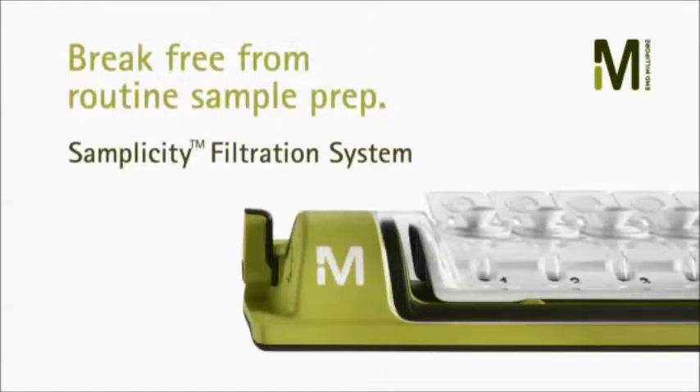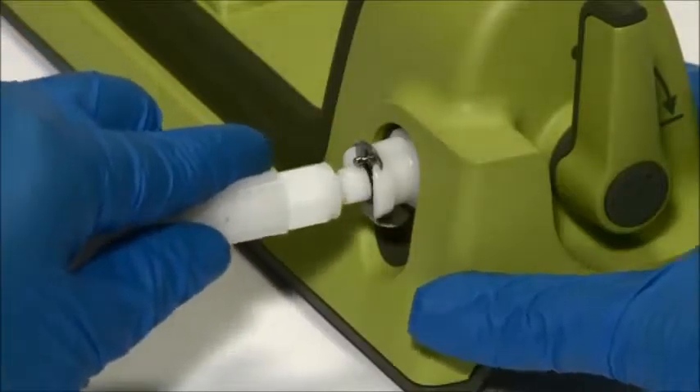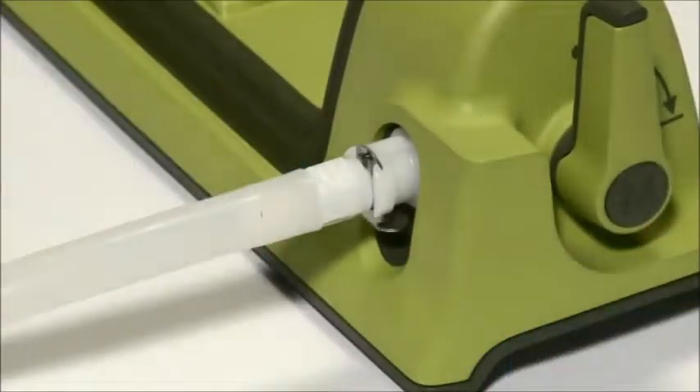Simplicity is a vacuum-driven system, so you can use it to filter up to 8 samples at the same time. Your first step is to connect the system to a vacuum pump or house vacuum using the connection tube provided.